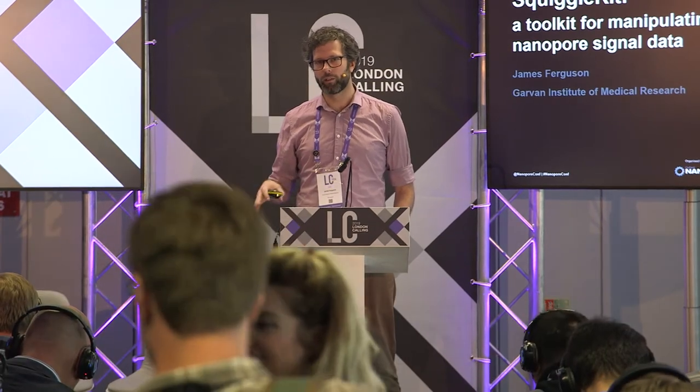So with this session, I'm going to go over the toolkit and explain motivations behind it, how some of it works, and a quick example. But I'm going to fly through my time a little bit quick so I can maybe ask you some questions and get some feedback. And if you want a little more explanation on any of the tools, we can do that.